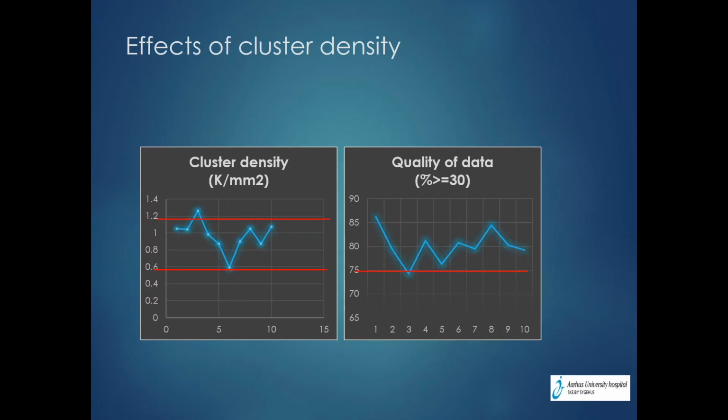A few are in the last part of the period, as you can see, and that's due to some thermocycler problems that we've had, but it's nothing to do with the method itself. We had to send the thermocycler for repair, so that's what's affecting the loci failing in the last part of the runs. But it's still very few, and for the most part many of the samples have been typed previously. Either they are for organ donation and we know the typings beforehand, so very few of those failed loci result in repetition of a sample. We most of the time are able to report everything. And then I would say maybe one sample out of 24 every second week we need to repeat, or something around that. It's very few samples we actually need to repeat.